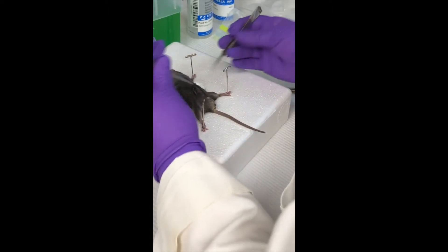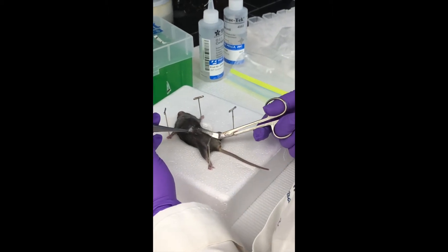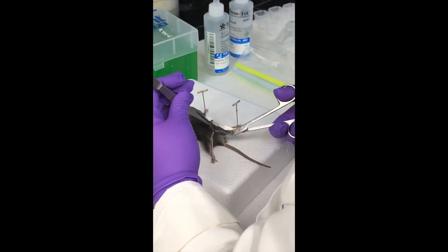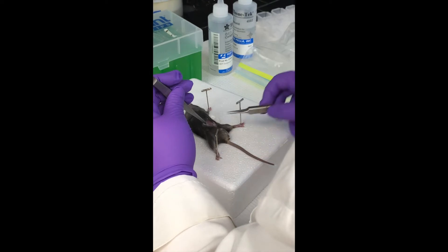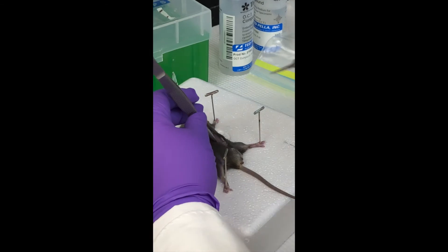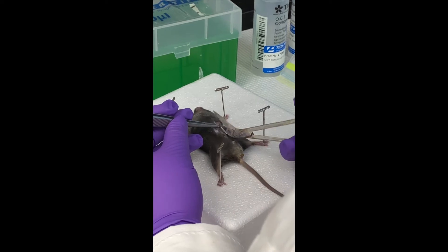Let's begin with the video. So I'm through the fur now, but there's another layer of skinny stuff. I haven't done that far yet — it's pretty thick. There we go.